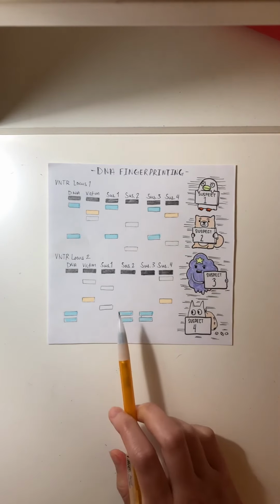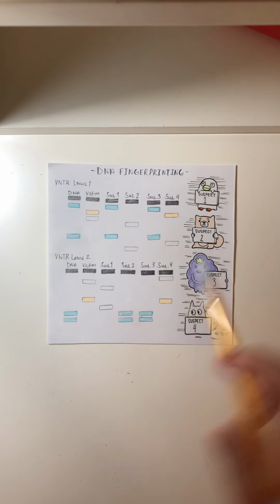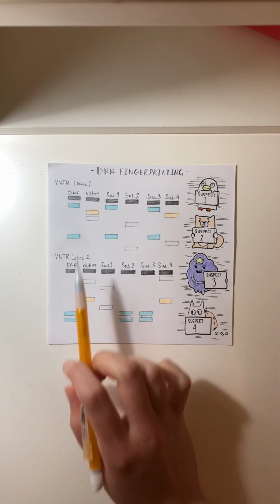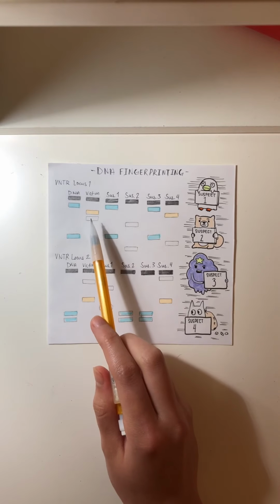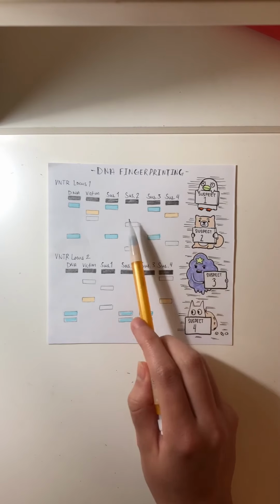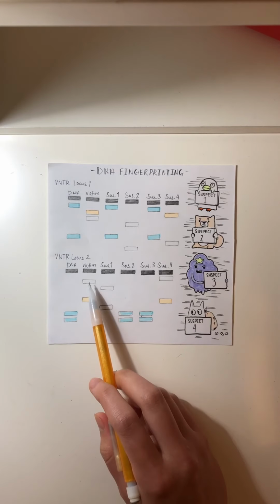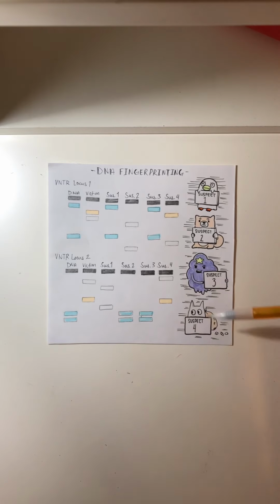And so in our scenario, Kermit is also looking for his fatherly figure, who he suspects is one of the 4 suspects. And so looking at Kermit, or our victim/witness, his DNA here, you can see that one of the bands matches up with suspect 4 over here, meaning they have one common allele, which we can see later is one same allele for both loci. And then here in locus 2, it also matches right up here. And so suspect 4 here, our little ghost rabbit, would be Kermit's father.